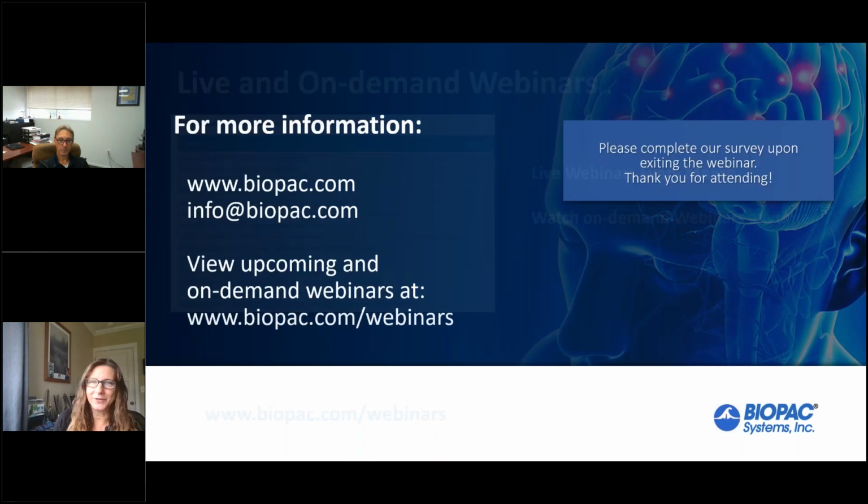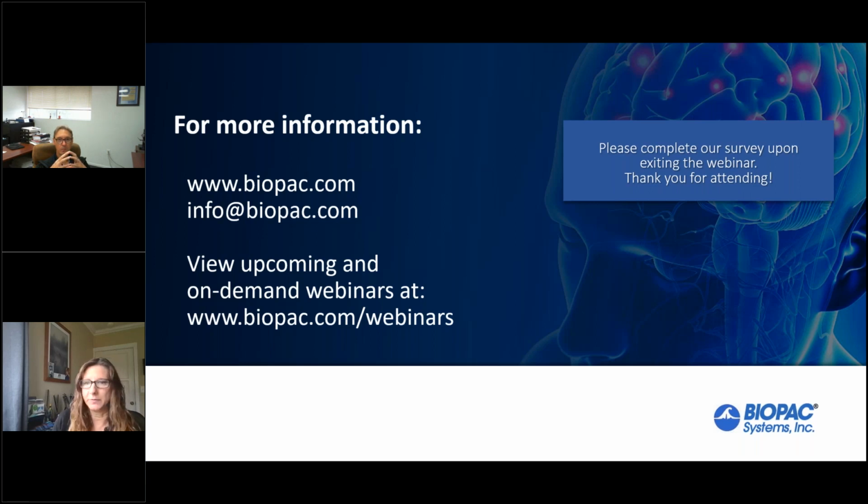And I just want to thank Fraser for all of his work in putting this webinar together. It's a great training for using this tool, and from what I hear from people who are using it, they love it because it just really reduces their workload, makes them way more efficient and productive, and it makes it more repeatable as well.